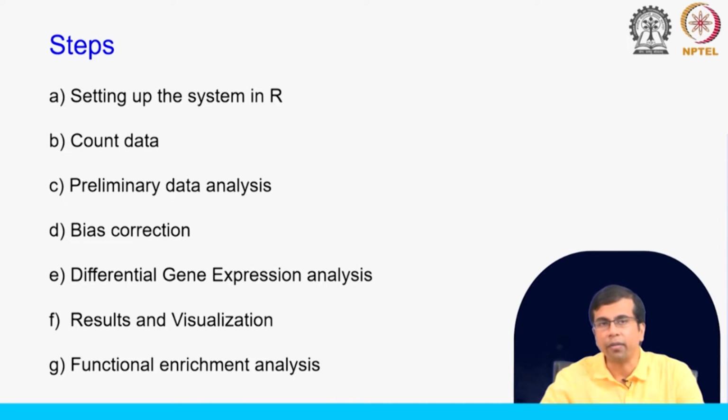There are different tools that you can use, but we will use one tool to do the enrichment analysis from our data set. So, this is the agenda. Let us start with the first part, which is setting up the system. We will have a brief introduction to R, how to set up R and very basic commands in R, followed by setting up the system for the data analysis. And if time permits, we will also talk about data loading, where we can load the count data and look at some of its characteristics.